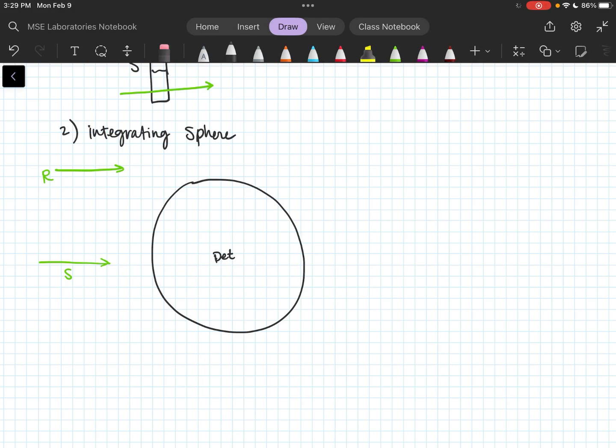If you were to imagine a person holding a balloon, the knot at the bottom of the balloon is the detector. And if I were to poke the middle of the balloon, where my finger is poking, that's where the sample is. That's impossible to draw in 2 dimensions.